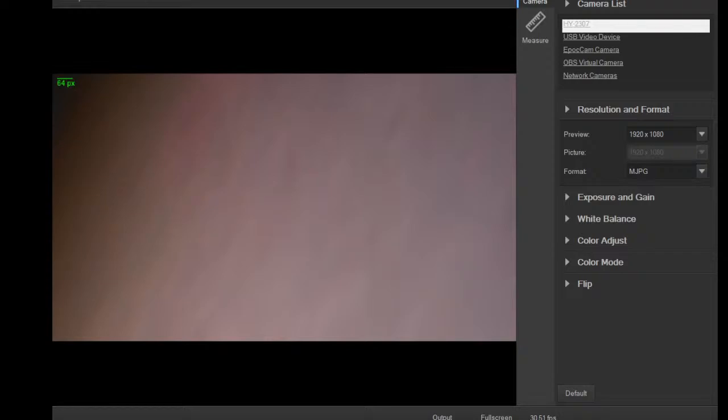I showed salt on one of the shows I did here, which was pretty cool because you get table salt, the standard sodium chloride table salt. It usually forms little cubes, basically like little Rubik's cubes. I put it on my dissecting scope with the backlight as well as the top light, and going between the two, you can see almost a tiny diffraction pattern on the crystals when you change the light on them. It's pretty interesting.